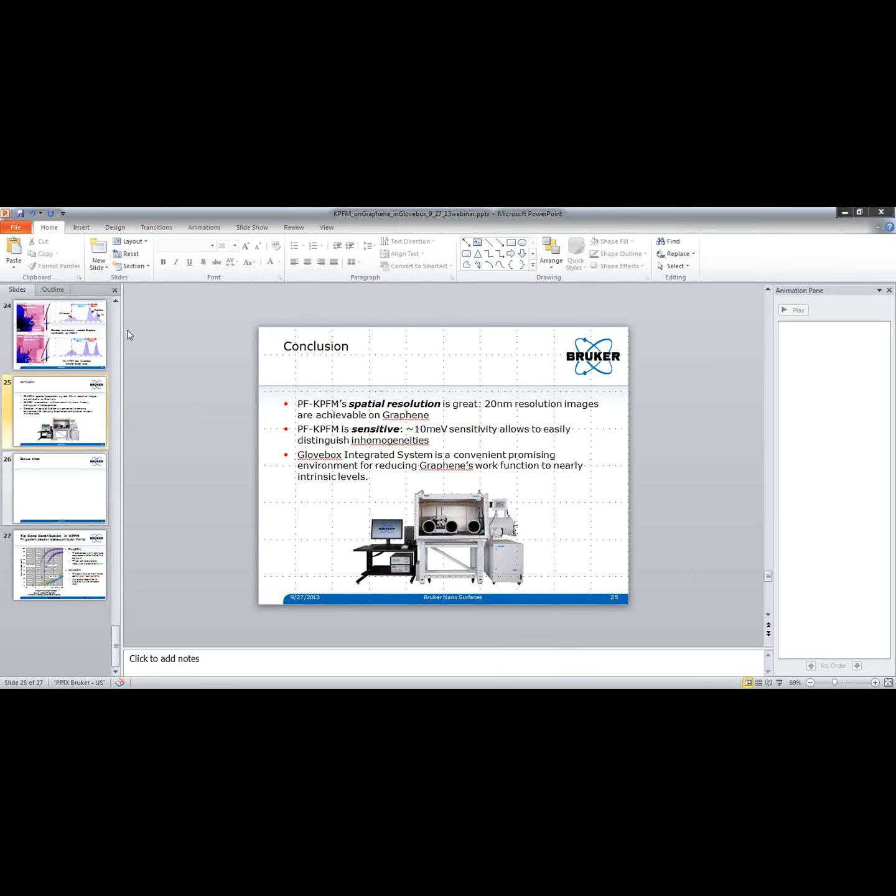Well, you want to study doping interactions of graphene with other gases and substrates from a sensor perspective, for example, if you want to try and do something useful with it, or from an electronics perspective, you want to try and minimize or control the doping. You might want doping for certain semiconductor applications, if you're trying to make a PN junction or something like that, or you might not want doping depending on what you're trying to do. And when you have doping, you are always asking the question, is the doping uniform or non-uniform? You ideally want uniform doping. You don't want non-uniform doping. So to study the level and the distribution of doping is very important.